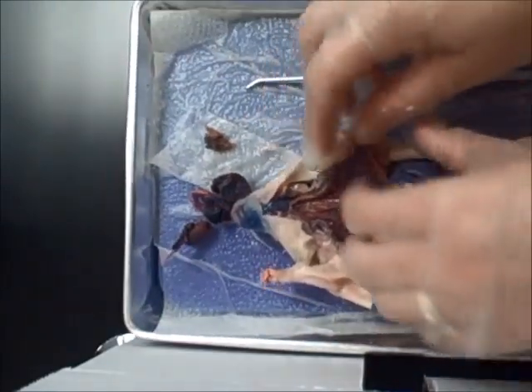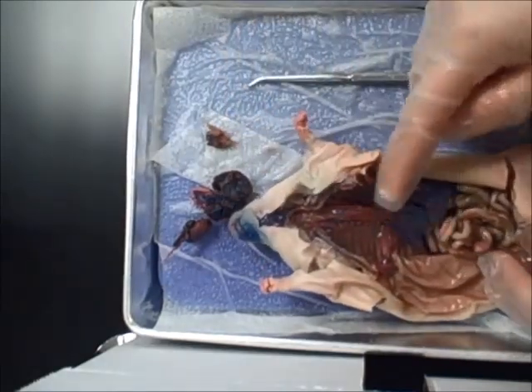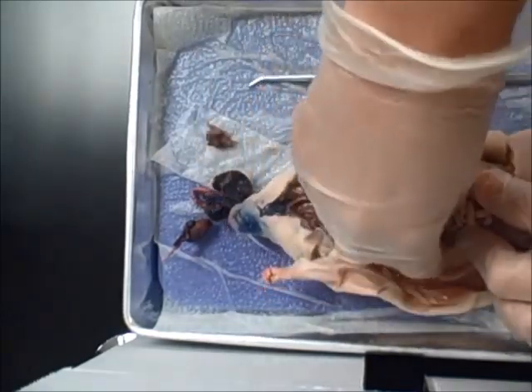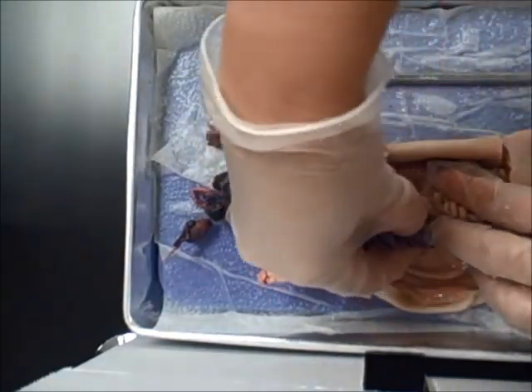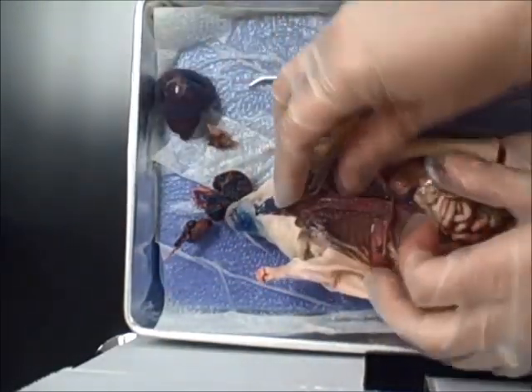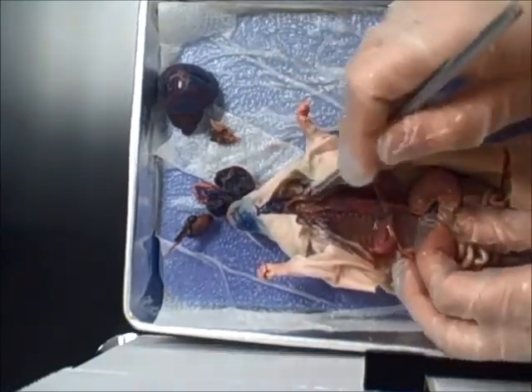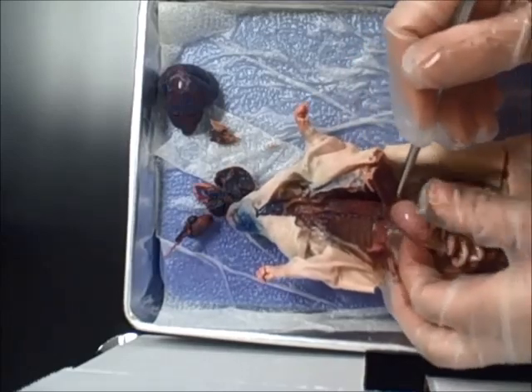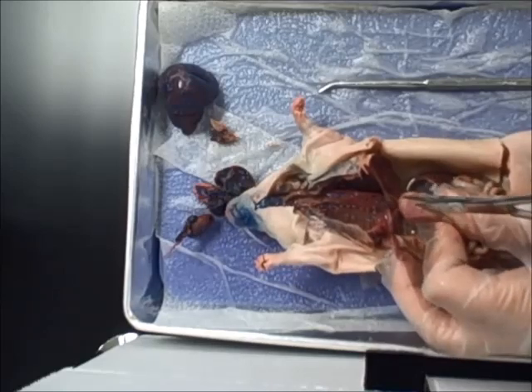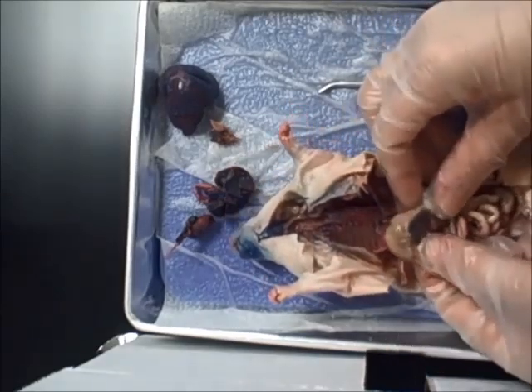Back to the rat. The large structure that you see just posterior to the diaphragm is the liver. The liver has 5 lobes, functions in secreting bile and detoxifying the blood, removing toxins. Rats eat lots of yucky stuff, so the liver is very large. Underneath the liver you have the stomach, and the esophagus that we saw running right behind the trachea goes to the stomach. And so the stomach has the digestive food that it had for its last meal. So there's the stomach.